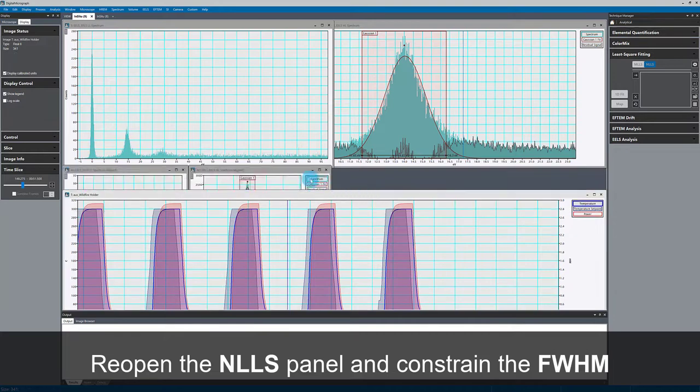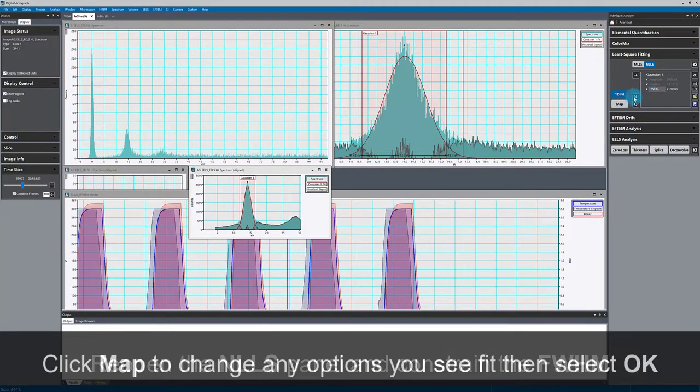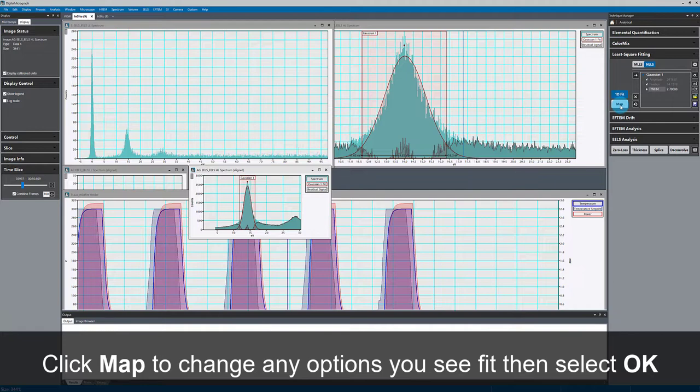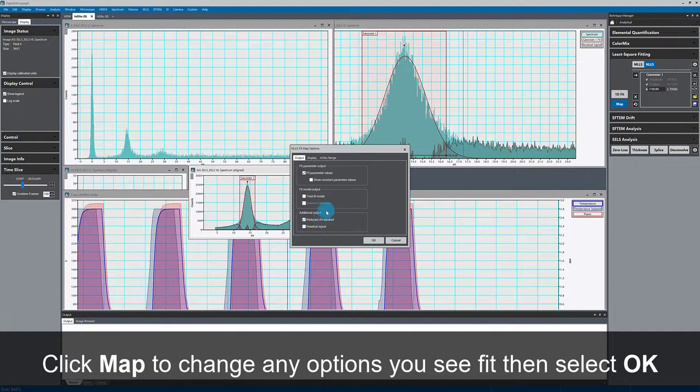Since I'm happy with this fit, I can now apply this very easily to the entire aligned dataset by pressing map. I'll also output the reduced chi squared and all of these other default options are fine.